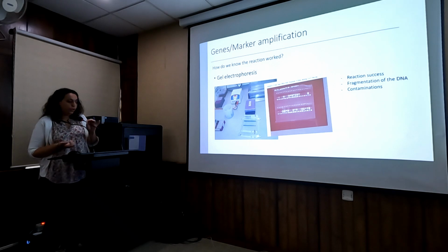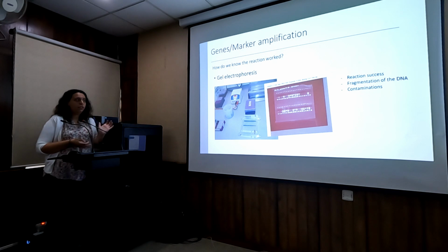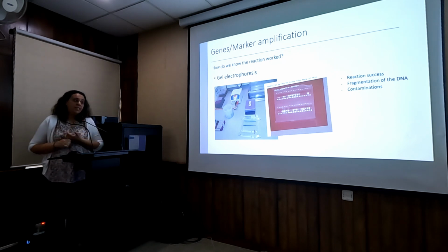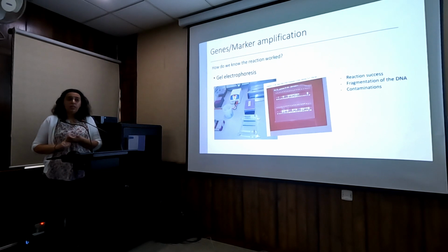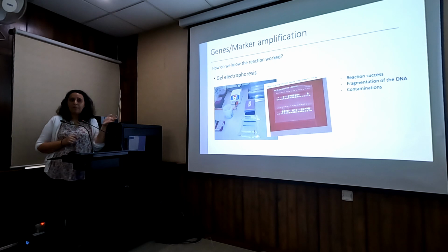So then how do you know if it works? People do this in different ways. I usually just run a gel with electrophoresis, and you see the bright bands will tell you which samples worked and which ones didn't, but it can also tell you if the DNA is very fragmented or not. We're not going to get into how, but just so you know, there's more than one thing you can get out of this gel. It's not just a yes or no, did it work or not. It can also tell you that the fragmentation is important, because if it's a herbarium specimen, you will see it already in the gel after DNA extraction, if it is very fragmented or not.